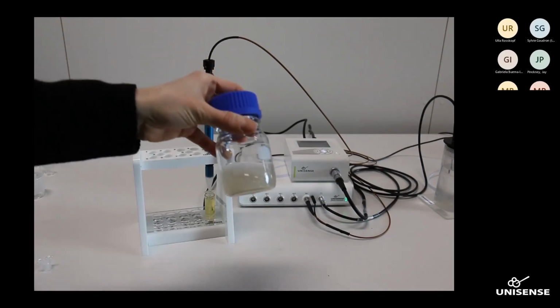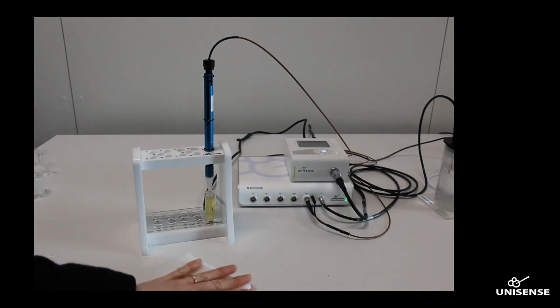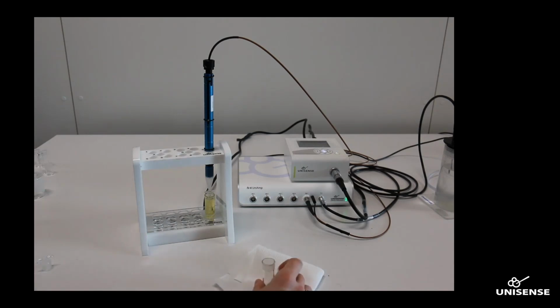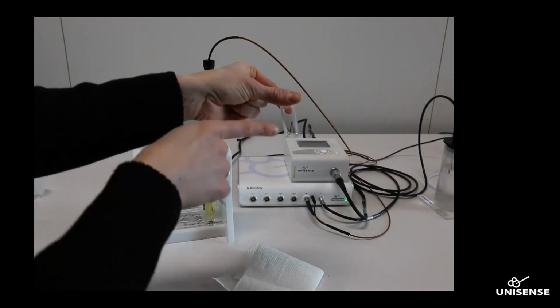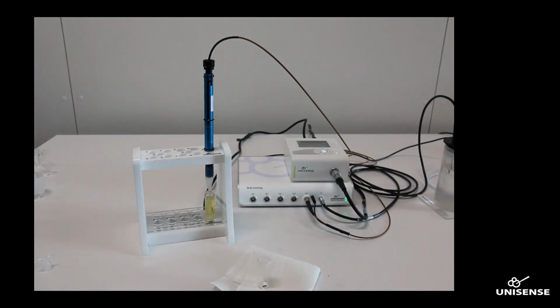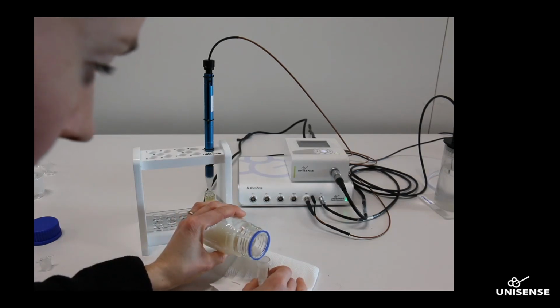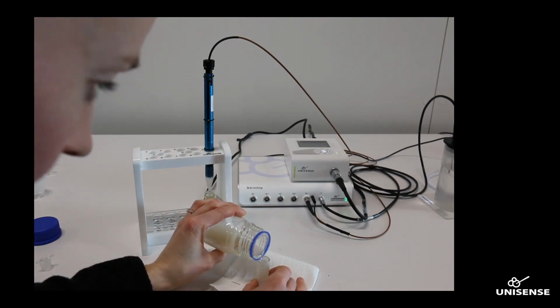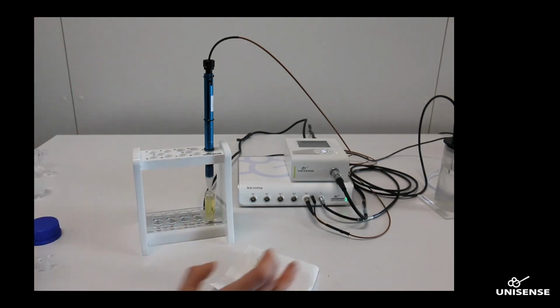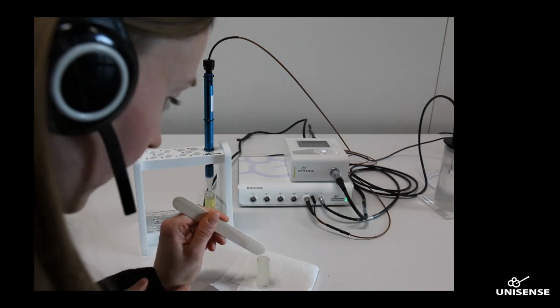I have a yeast solution prepared here. Good. So I will take a glass chamber here, and I have added the magnet to the bottom of the chamber. Then I will take the yeast solution and pour it into the chamber here. It's important that you fill it up completely and that you keep an eye on air bubbles. You don't want air bubbles inside of your sample. So I will just remove a small bubble that I have here.